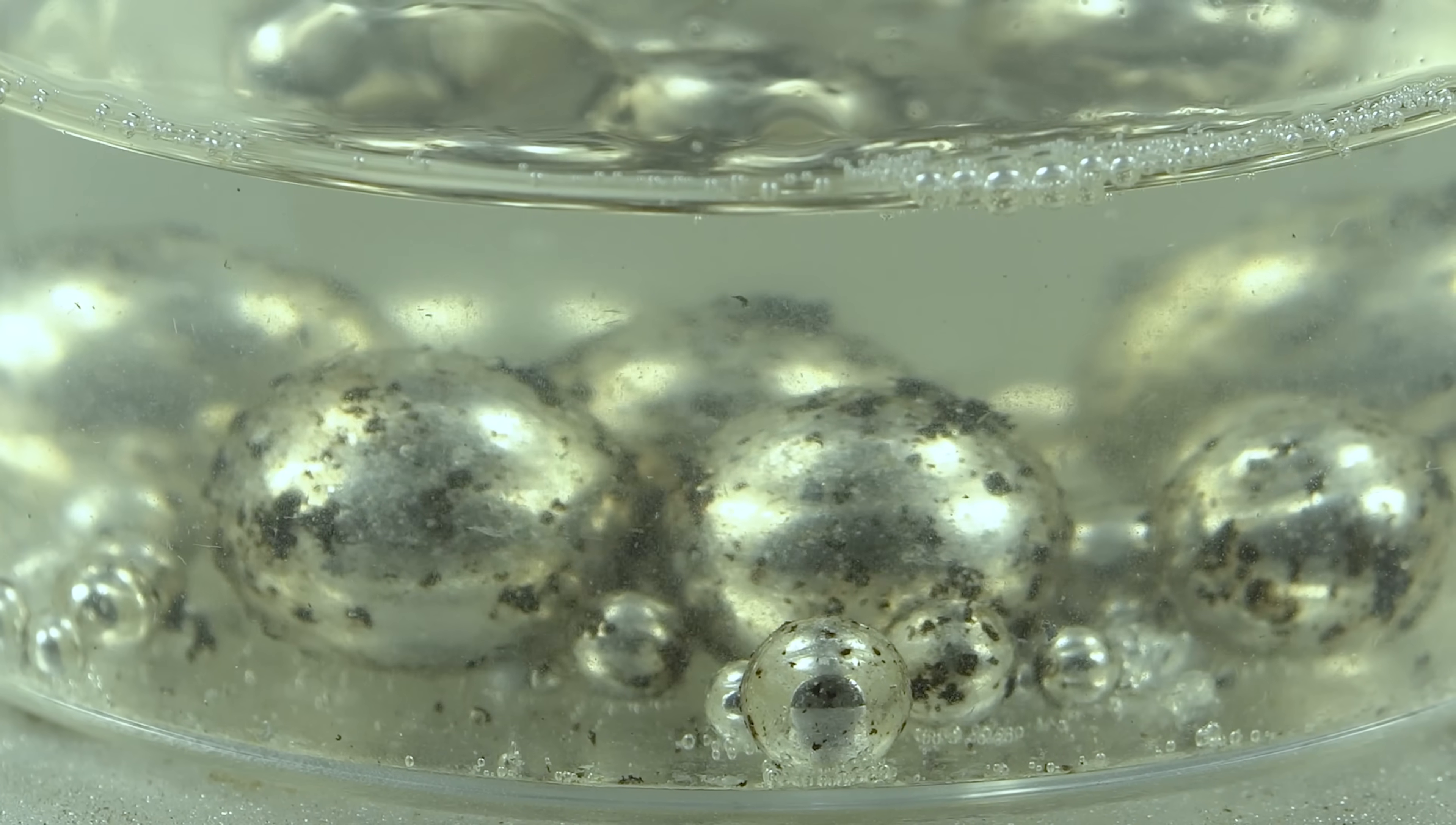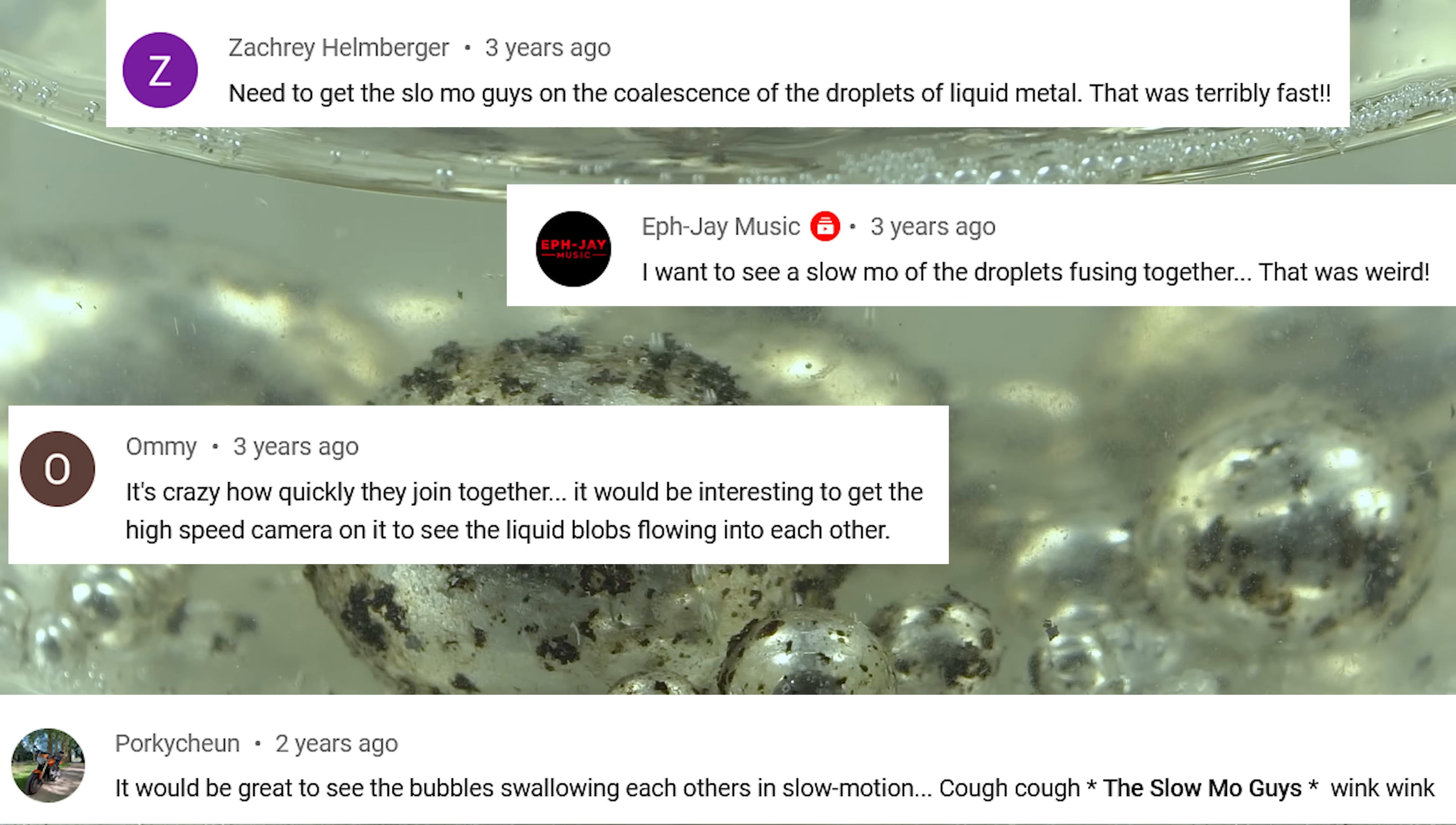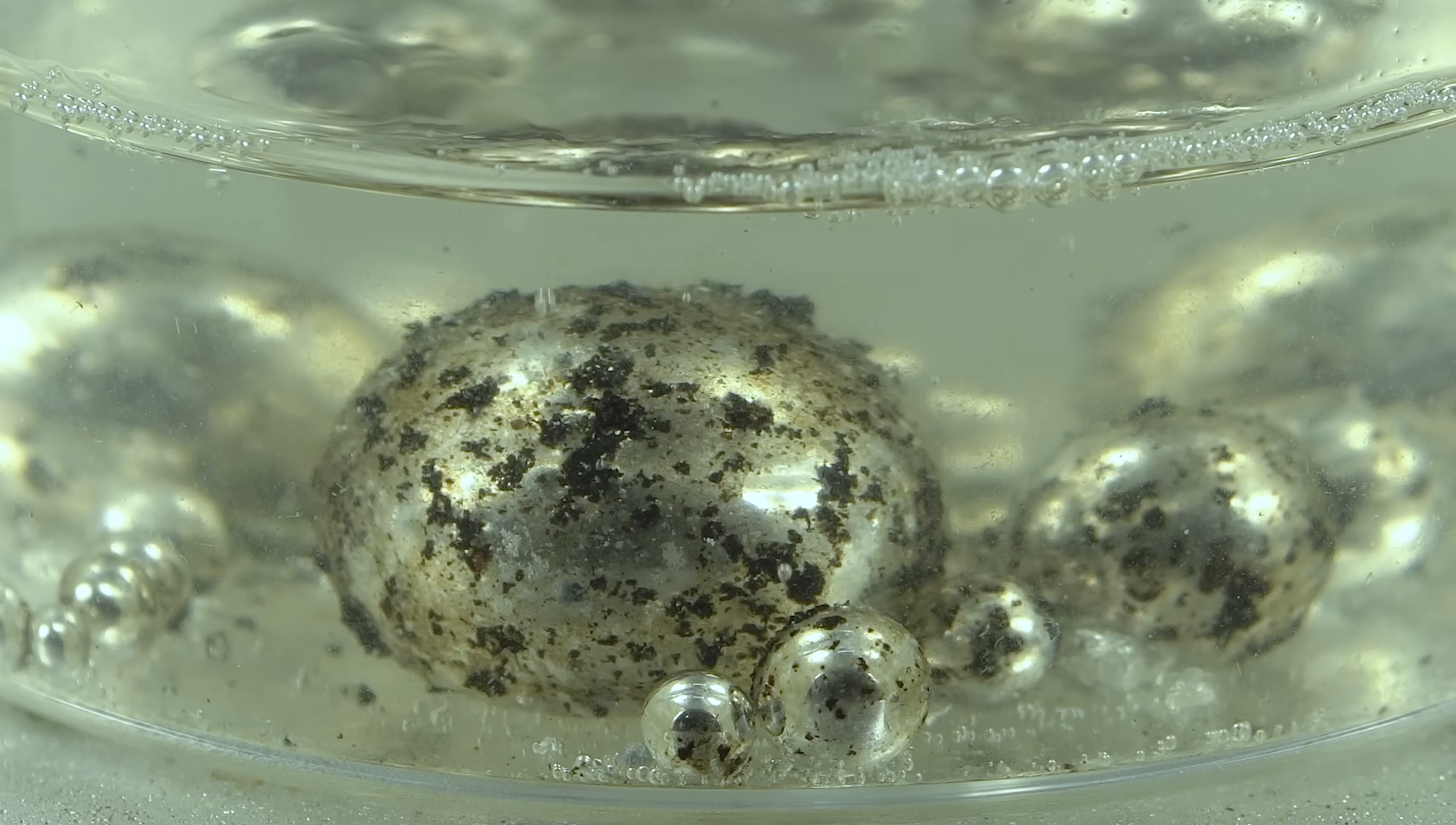In one of my previous videos, there was a moment when one drop absorbs another. However, some of you requested to show it in slow motion. Well, today I have the opportunity to show you it from different angles, including slow motion shots.